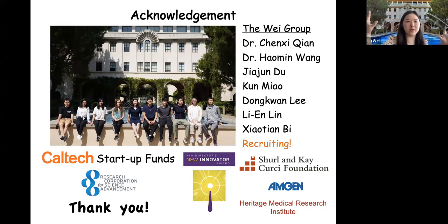So if we want to generate a mosaic, then that's this number times the number of mosaic images we want to take. But on average it is somewhere between tens of seconds for a typical image and a couple of minutes for a mosaic image. I hope that answers the question.